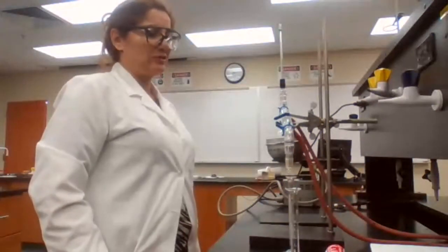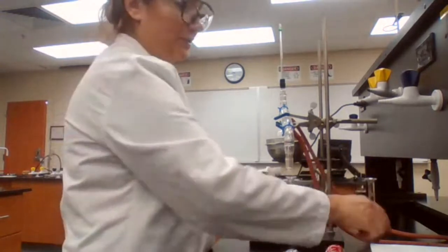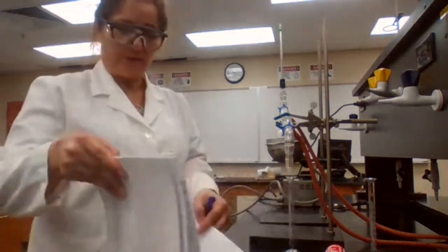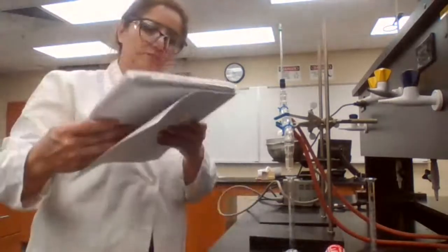The other concern for the experiment is to collect the numbers. You are going to collect the temperature of the vapor, or the thermometer, for every milliliter of the sample that you are recovering, starting with the first drop.